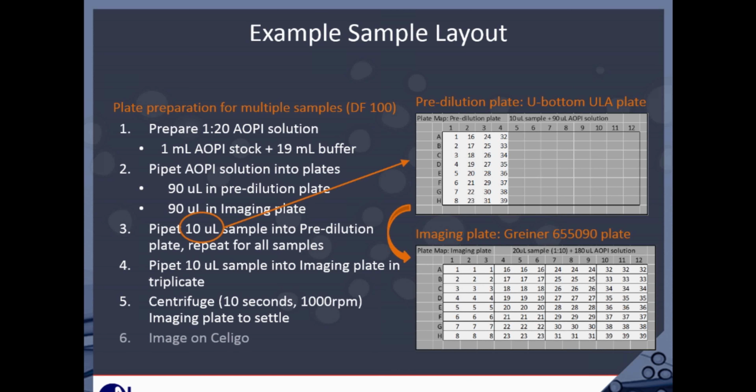So at this point, you can recall your saved experiment settings that you saved from our testing of the linear range for the unknown samples. So that's just an example of how you would actually image the plate with unknown samples.